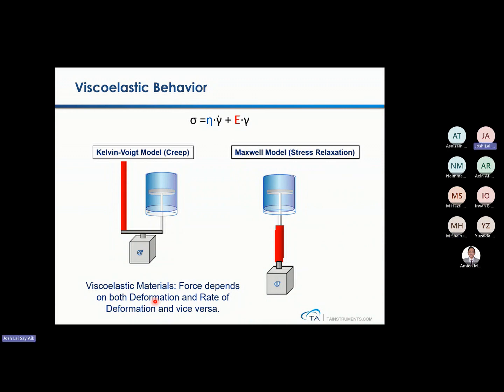Because tensile machines will not tell you loss modulus and storage modulus. They will only give you a general strength, a general modulus that resists change, resists displacement. But rheometers can tell you whether the resistance to change is based on solid behavior or viscous behavior.